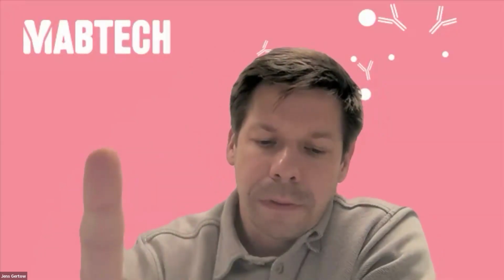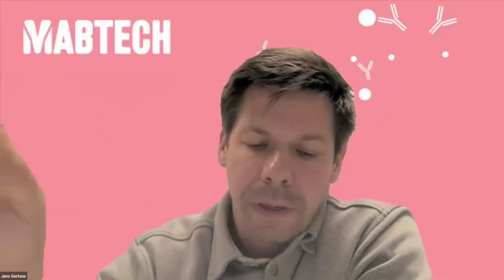Right. Some questions that came in previously were about resting, and you addressed resting, Tyler, in your session, but I think you talked mainly about overnight resting. Can one rest cells for a shorter time? Have we tested 4 hours, 30 minutes?